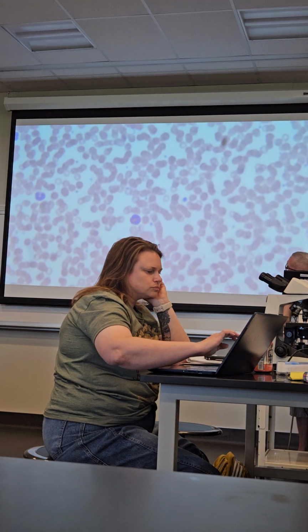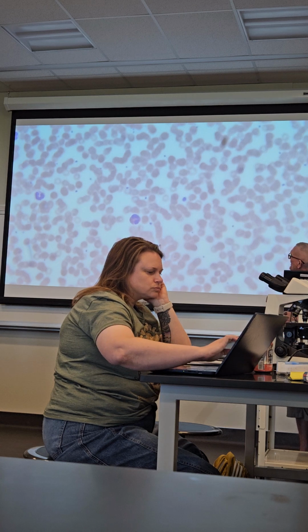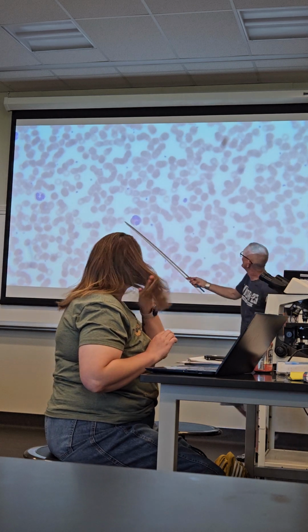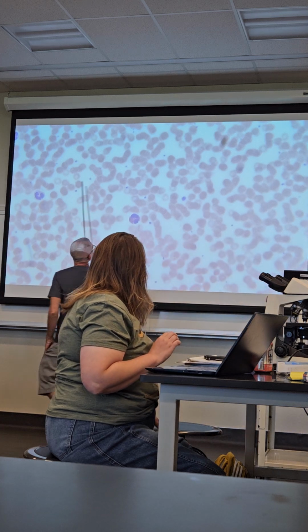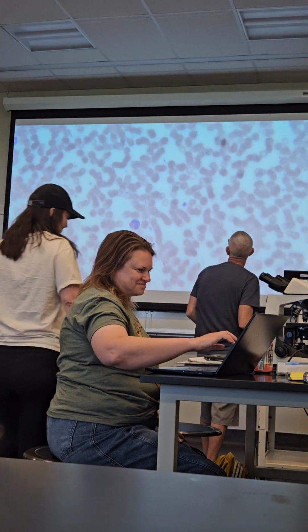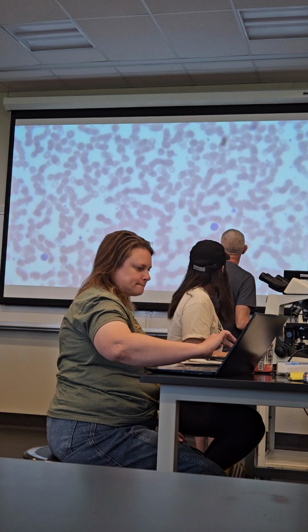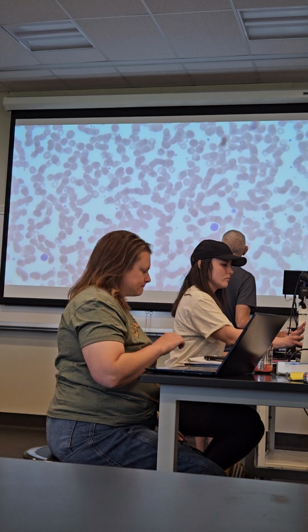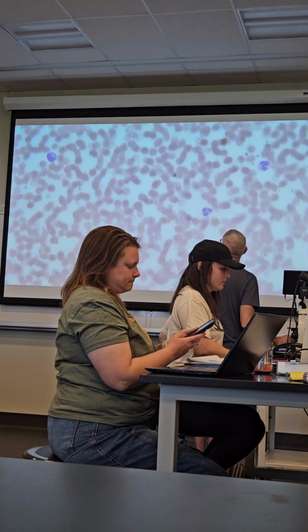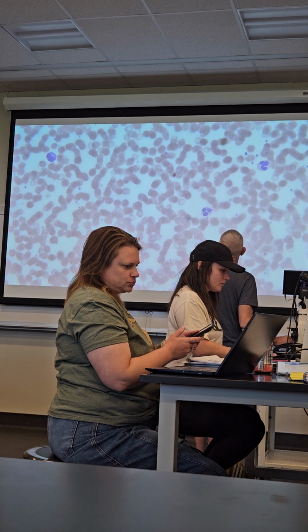In particular, neurology. Oh, there's the other. What's that guy most likely? There's eosinophils. Yeah, that's an EO. That's a neutrophil. It's an abnormally big platelet. What do you guys think that one is? Lymphocyte. Yeah, that's a lymphocyte. Don't confuse leukocyte with lymphocyte. Lymphocyte is the cell. Leukocytes are all of them together.